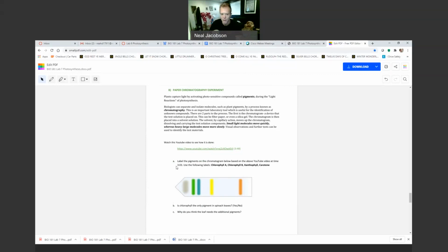We can use the timestamp 303 to find exactly where those are. Now, I'm not going to do it. You guys are going to do that. And it's not that hard. And so you'll just label chlorophyll A, B, xanthophylls, and carotenes.